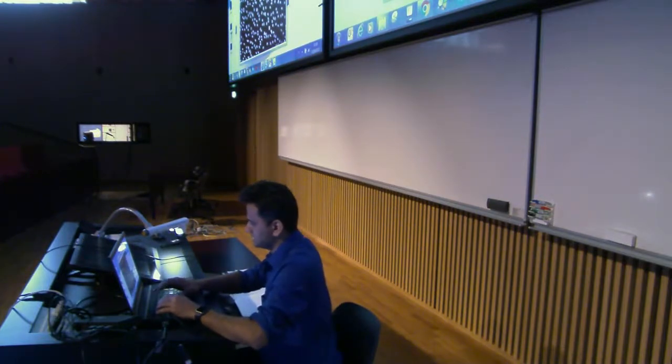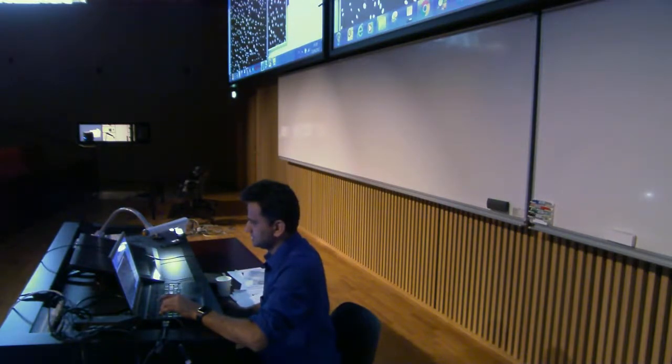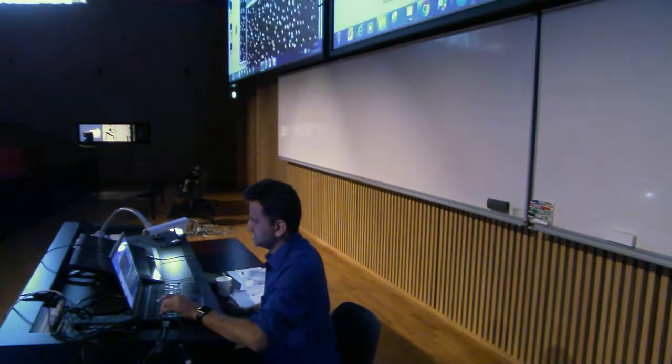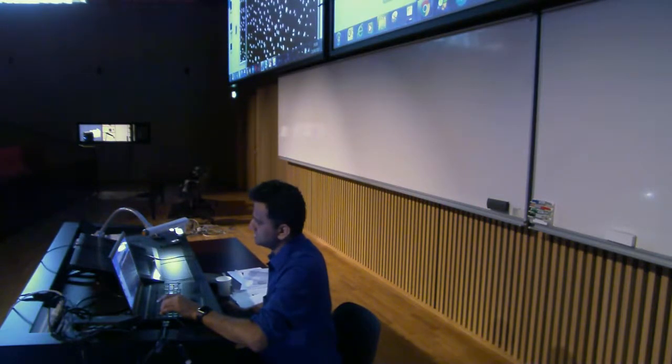Why is it not displaying this? It's because maxima within the tolerance, go for 400. Yeah, this is what it is, so it's segmented, see? That's like a maxima. Using this image, when you put in those particular settings, it automatically segments based on your maxima.